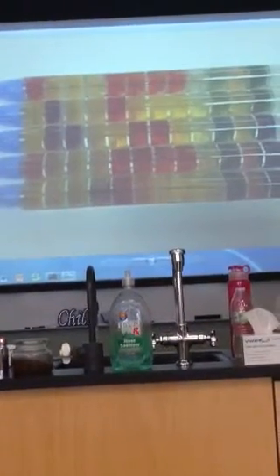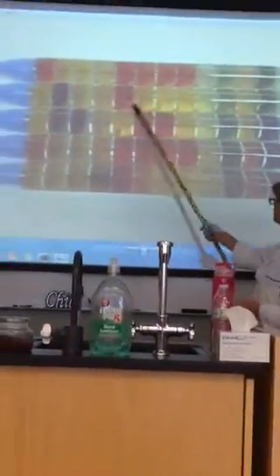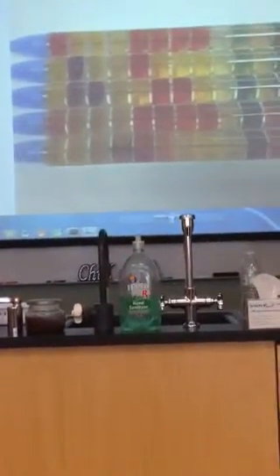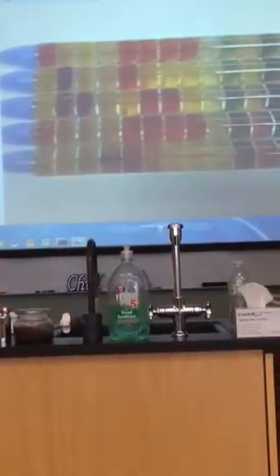So, how can I differentiate one Enterobacteriaceae from another? They're all glycolytic, so looking at their glucose reaction isn't going to help. But I can look at the difference they have in amino acids, and I can look at the difference they have in other sugars, okay? Some are lactose fermenters, some are not. Some will ferment adonitol, some will not. And same with amino acids.